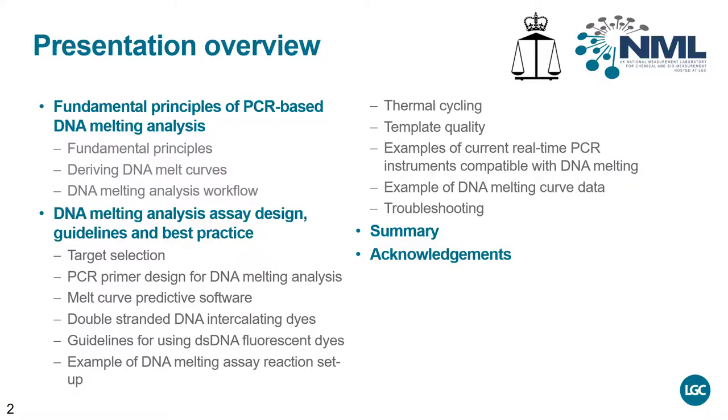Topics covered in this e-seminar will include the principles underpinning DNA melting analysis, DNA melting analysis workflow, designing PCR DNA melting assays, fluorescent dyes suitable for use with DNA melting analysis, generic values for thermal cycling parameters, examples of PCR instruments compatible with DNA melting analysis, examples of analytical software packages, and guidance on troubleshooting.